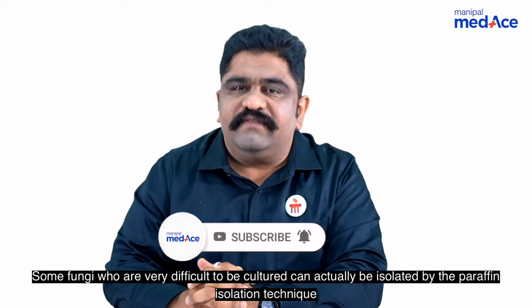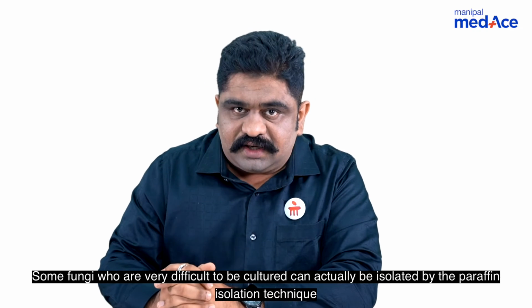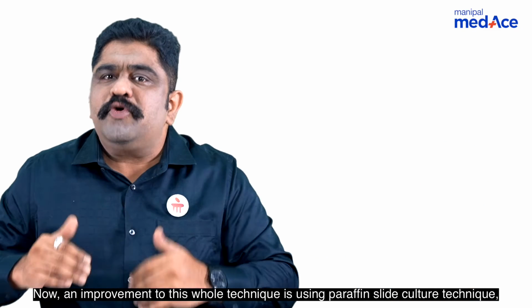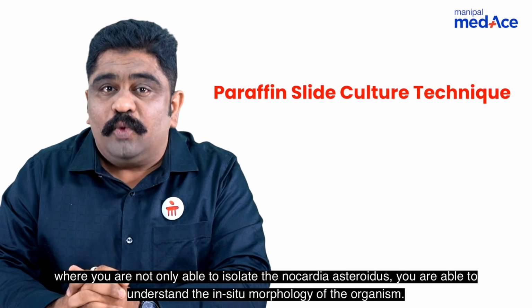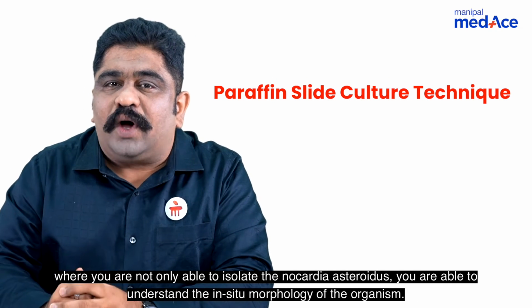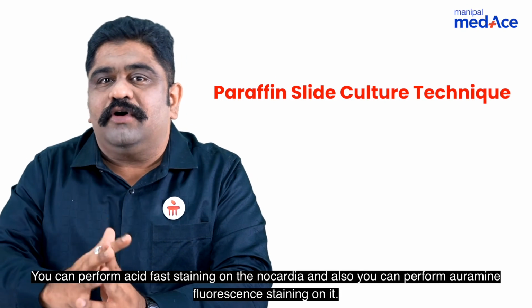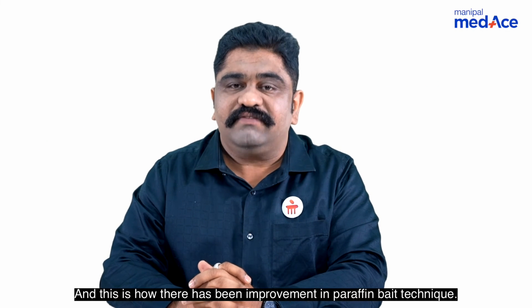Some fungi that are very difficult to culture can actually be isolated by the paraffin isolation technique, and Nocardia asteroides has been very well isolated using the paraffin bait technique. Now, an improvement to this whole technique is the paraffin slide culture technique, where you're not only able to isolate Nocardia asteroides, you're able to understand the in situ morphology of the organism. You can perform acid-fast staining on the Nocardia, and also auramine fluorescent staining on it. And this is how there has been improvement in the paraffin bait technique.